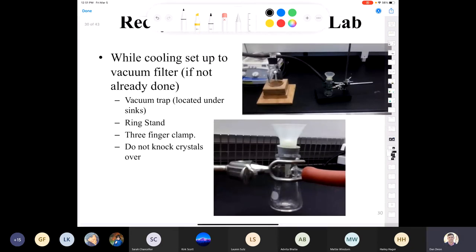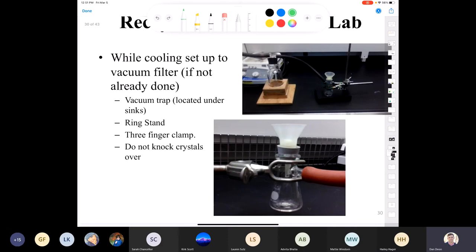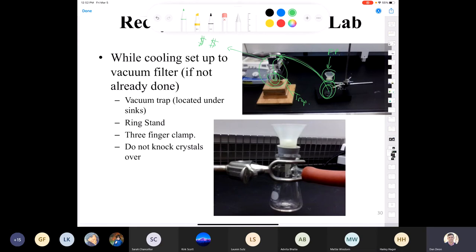Setting up the Hirsch funnel: here's the Hirsch funnel on a vacuum flask. You can see that the scientist clamped the vacuum flask with a three-finger clamp. The Buchner/Hirsch funnel has the filter paper inside and the vacuum hose is attached to what's called a trap. The reason for a vacuum trap is so that if you had excess filtrate and the vacuum was on, the excess filtrate would end up in the trap and not in the university vacuum line, which is very expensive to repair.